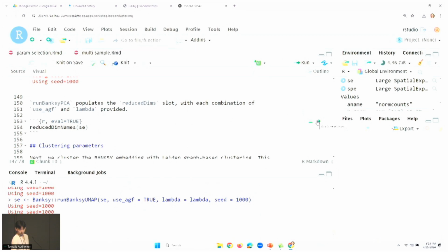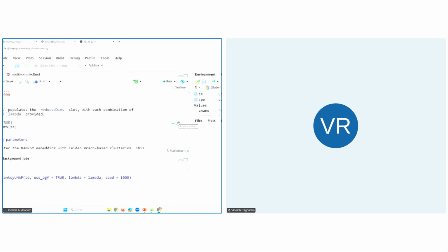And also multimodal, right? Just while you're on that, histology and multiplex immunofluorescence. I think this is where the matched versus unmatched thing comes in. As long as for a given cell you have those features, like your IF data and your histology, then pre-processing is usually the key there. You do want to get that into some sort of compatible state, but probably the first place to start is to use standard pre-processing steps that exist for those data sets, append those values and see how that goes.